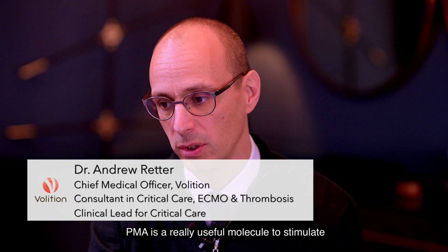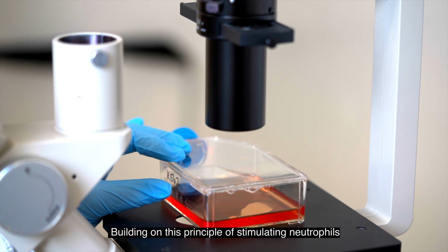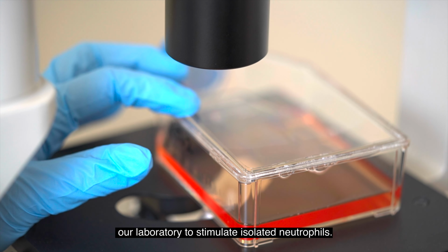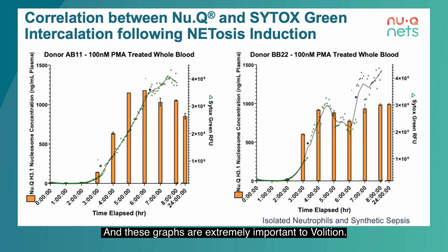PMA is a really useful molecule to stimulate neutrophils, but it's not a naturally occurring molecule. Building on this principle of stimulating neutrophils with PMA, we developed a model in our laboratory to stimulate isolated neutrophils. These graphs are extremely important. What they are showing is a very strong correlation between neutrophil stimulation, neutrophil extracellular trap release, and H3.1. You can see these green triangles that increase.